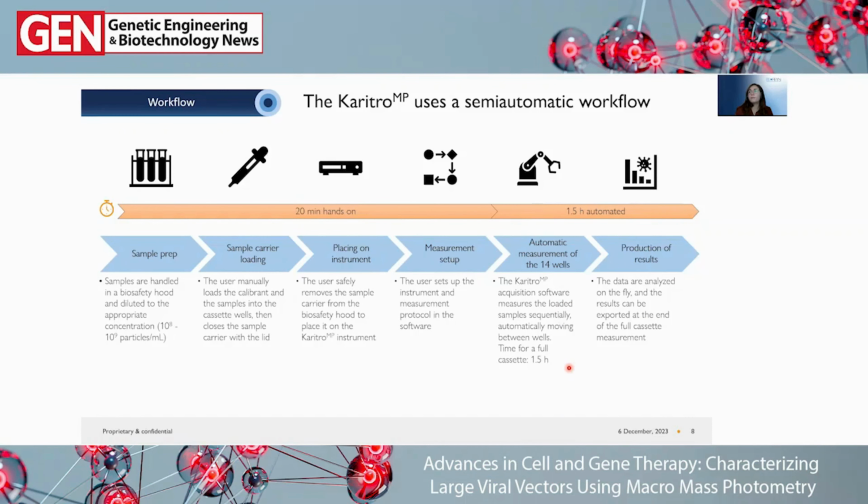And while the data are acquired, the results can be shown on the fly. And at the end of the run, they can be exported either for post-processing with the instrument software, or they can also be exported in a CSV file if needed to be post-processed with alternative software or programs.